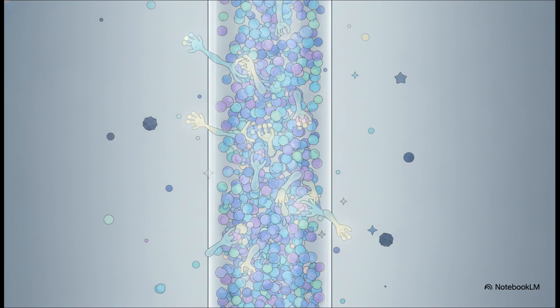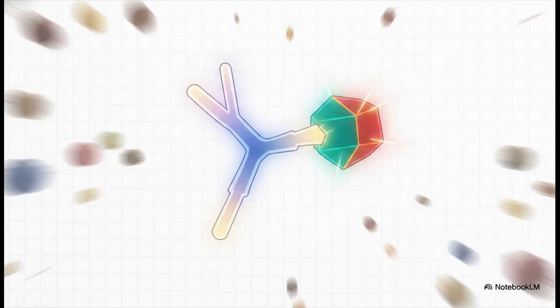Think of these beads sitting inside the affinity column as millions of tiny, highly specific hands just waiting to catch their exact target partner. Now, there are a ton of different ligands we can use, but antibodies are incredibly common. Why? Because they offer massive specificity and very large binding constants. The crucial point here is that when we use monoclonal antibodies, which lack the variability of polyclonal ones, we create a highly uniform, reliable affinity support. It forms this basically unbreakable antibody-antigen interaction the exact moment the target flows by.